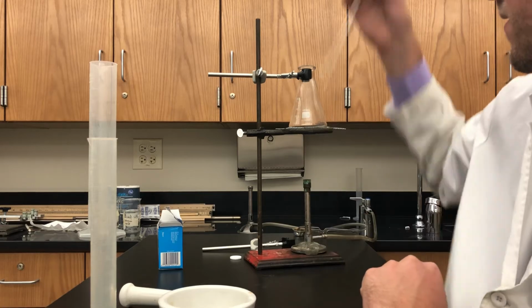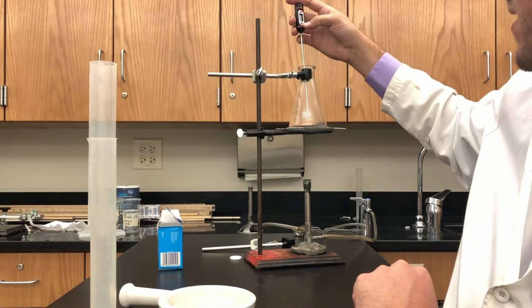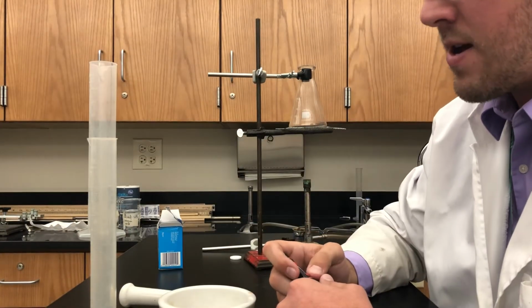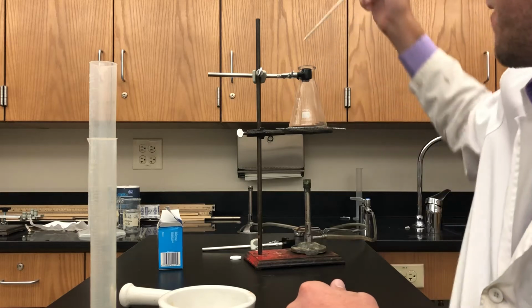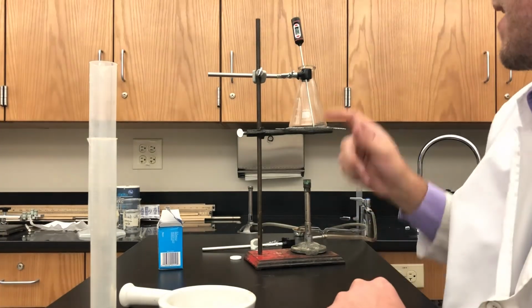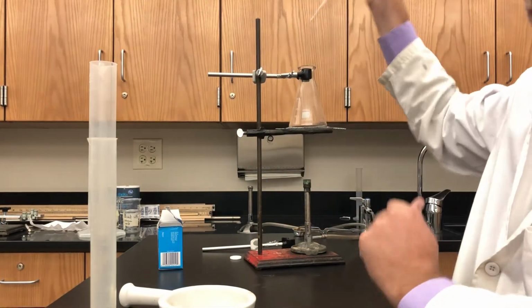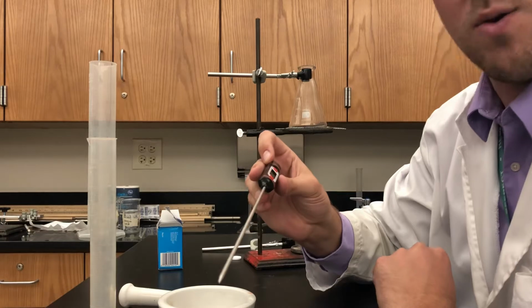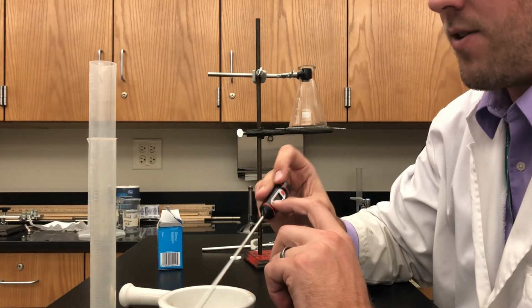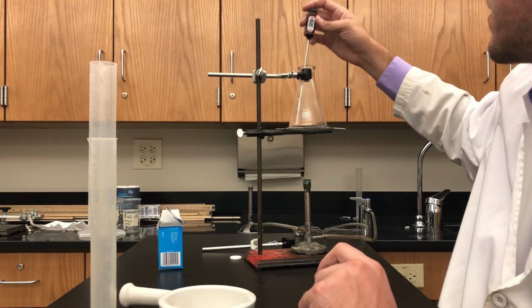So we've got some nice long stem thermometers here. You can take the temperature of your reaction. I'll let you decide what temperatures you're shooting for. The big thing to be careful with here is to not just sit here with your thermometer in the Erlenmeyer flask. There's a lot of heat going around there, and I've had students actually melt these in the past. Maybe I'll show you one that got melted 2 years ago. So please be careful to not just leave it in there, only put it in there for long enough to let the temperature stabilize.